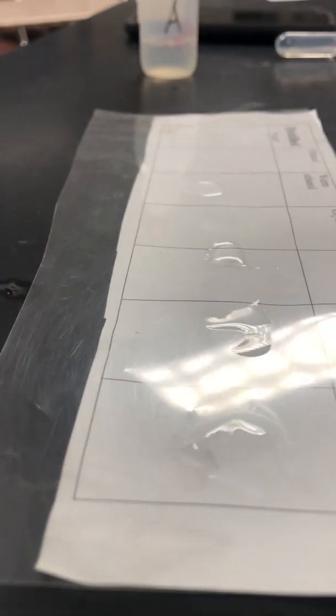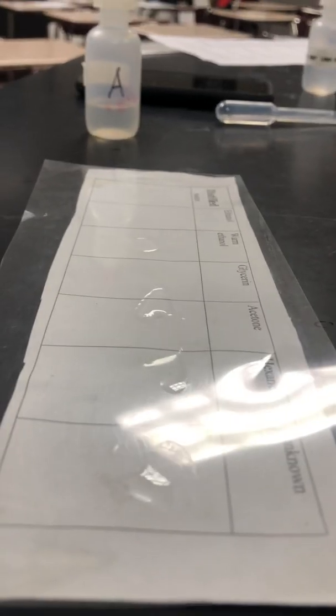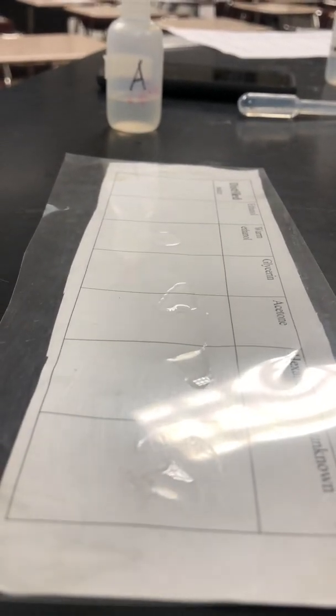So at this point, kind of move it around a little bit. You can see there's a little bit left. Remember, the temperature in the room is going to affect the evaporation rate too.